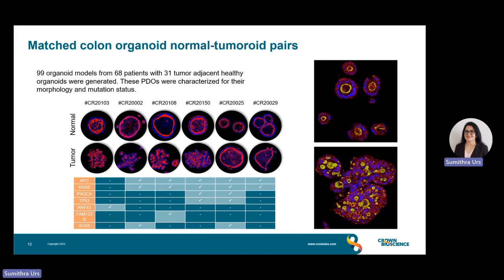The 500 plus therapeutic bispecific antibody candidates were screened against the CRC PDOs of multiple genotypes and phenotypes to assess their functional activity and compared to matched healthy colon mucosa organoids, as shown here in the two panels. Analysis was based on high content imaging to capture the complexity of PDO responses.